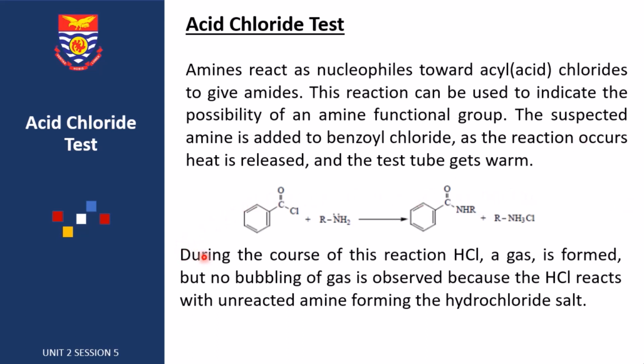During the course of this reaction, hydrogen chloride is formed, but it doesn't actually bubble out of the solution. This gas doesn't bubble out of solution as is observed because the hydrogen chloride reacts with unreacted amine to form a hydrochloride salt.